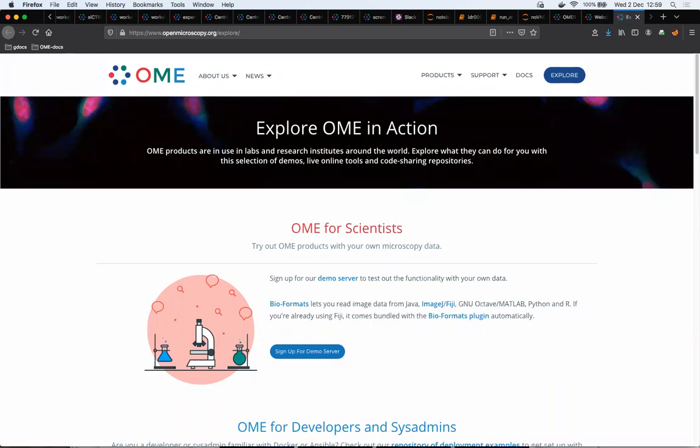You will be able to import your own data there. If you start to use it in anger, you probably need your own server, because that's not a server we guarantee. We know we need to update it from time to time, and I will not do my research in that environment, but it's a good way of exploring yourself. And if you want to present it to others, that's also possible without too much effort. You just request a demo account.